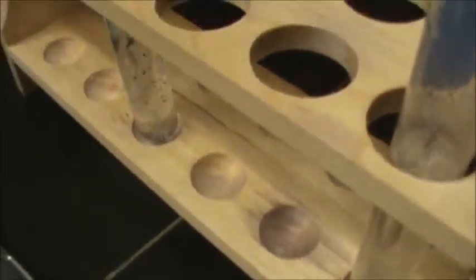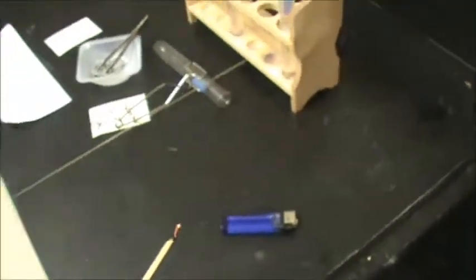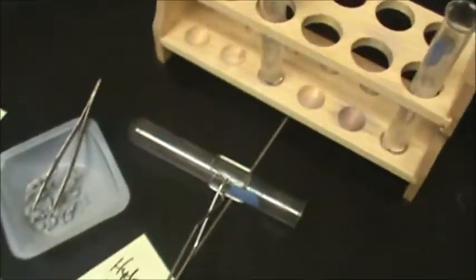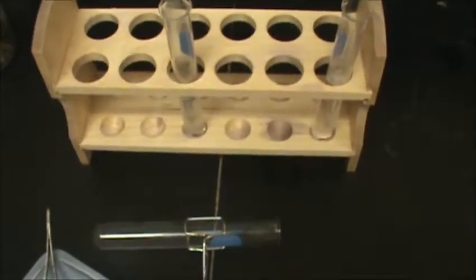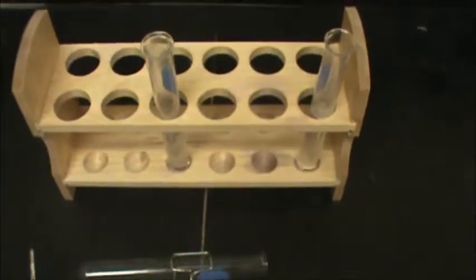It's still bubbling. And we definitely had a gas produced there, so we got to figure out what gas that was from this reaction. Zinc and hydrochloric acid produces a gas that's explosive. We had a nice pop. Alright, so you guys figure it out. You're putting this all into words. You're taking everything that you did in the beginning, putting all the words for the reactants and the products right here. Chemical equation should include the chemical formulas, the physical states for each chemical, and then any other special things that have to be going on during the reaction that should be placed over the arrow, such as any heat or catalyst used for each reaction.